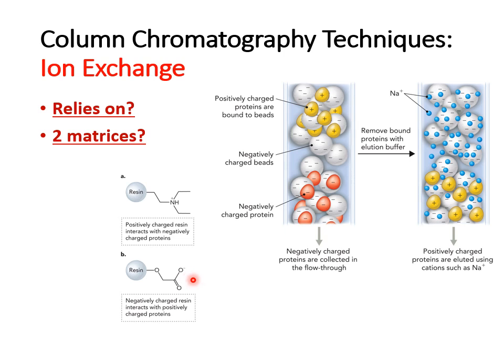positively charged proteins. And so they basically name them based on what they're trying to attract. So a positive charge resin is going to attract negative proteins, and we call negative charged proteins anions. You can underline the N in anionic to remind you that's negative. And so this one here would be called anion exchange matrix.